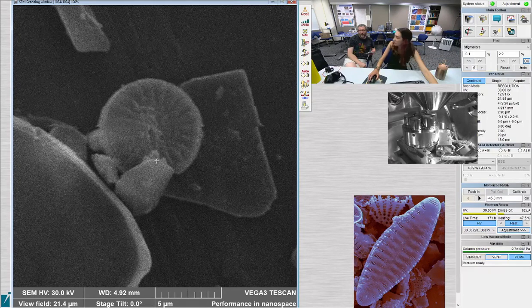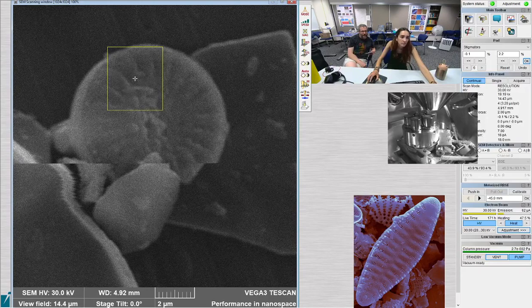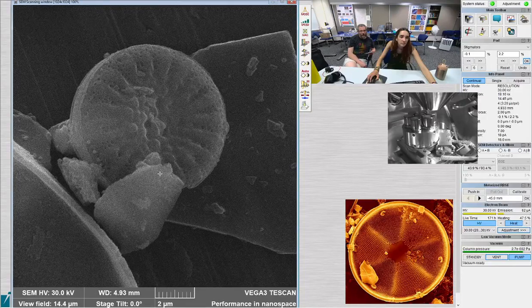That's the same Cyclotella, I think. I think that's the same one. But you should get a picture of that.